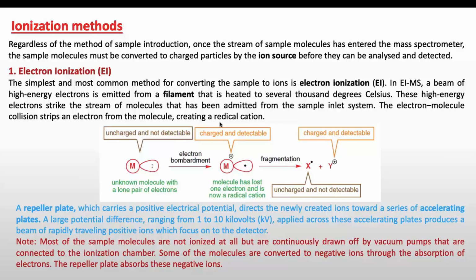You can compare it with a wall. When you hit a wall with a hammer, some bricks come out of the wall. It's very similar to that. When you bombard a neutral molecule with high energy electrons, an electron comes out of the molecule, and it converts the molecule to a radical cation. And further bombardment of electrons, because you are not stopping that bombardment, converts it to a radical and a cation.